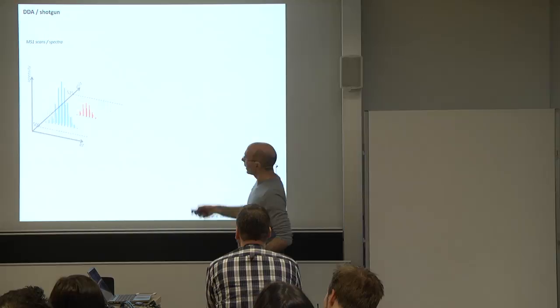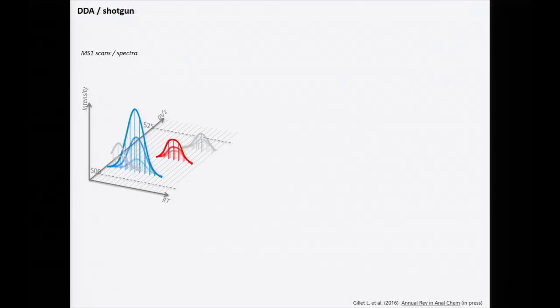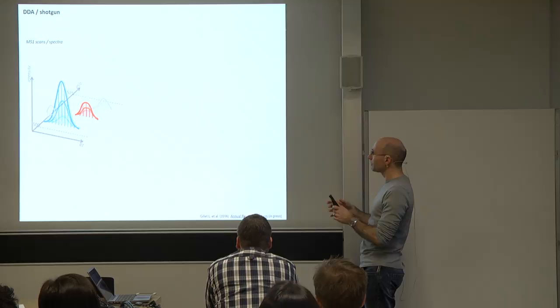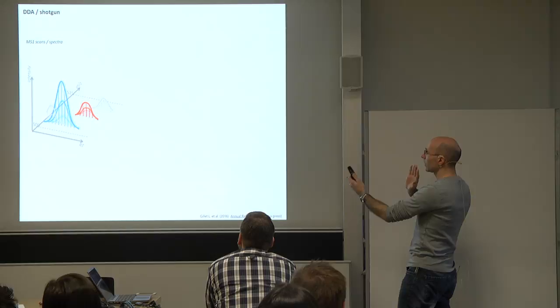And now, you have been using this entire week a chromatographic visualization of this type of data, and I hope it's now easy for you to visualize this data in the time dimension and not anymore in the mass dimension. In the past, because of the legacy of most of the old mass spec instruments, everything was spectrum-based. You see the spectra one after the other, and you need to use the arrow key to move from one spectrum to the other. Now most of the visualization and analysis that we do is in the chromatographic space. So we are really changing from one dimension to the other in order to sync this data and what we can do with this data, right?